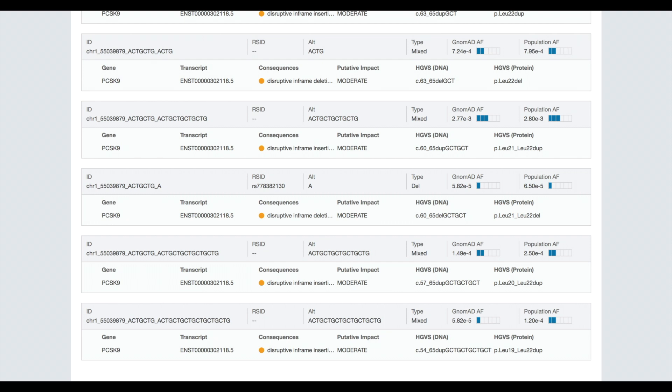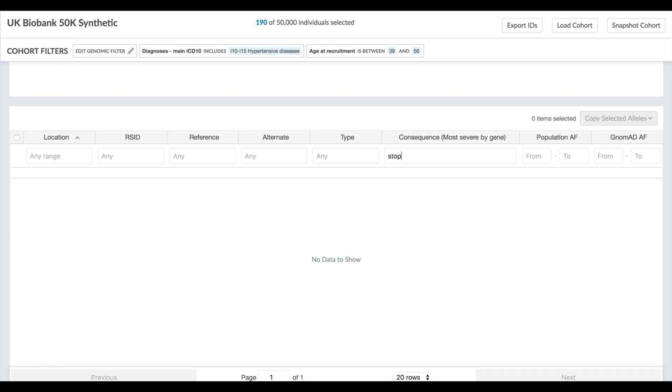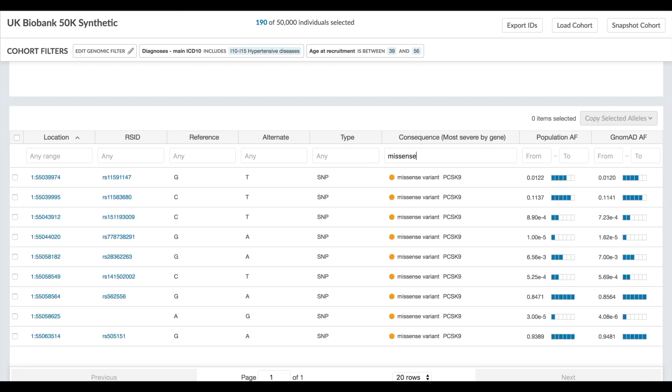Back in the main variant table you can search on each column to filter the list of variants. Do any of them affect a stop codon? Nope. How about missense variants? We see a few of those.